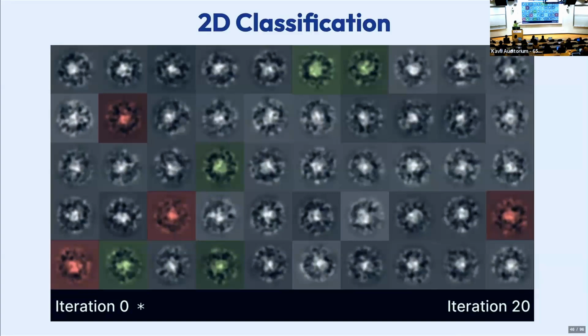You can see here, they're just blobs, right? And that makes sense. When we picked these particles, we know there's something in these images or we wouldn't have extracted them. So there's something and it's kind of in the middle of the image, but otherwise it's just noise. Then what we're going to do is take all of these references and line them up to each particle image.